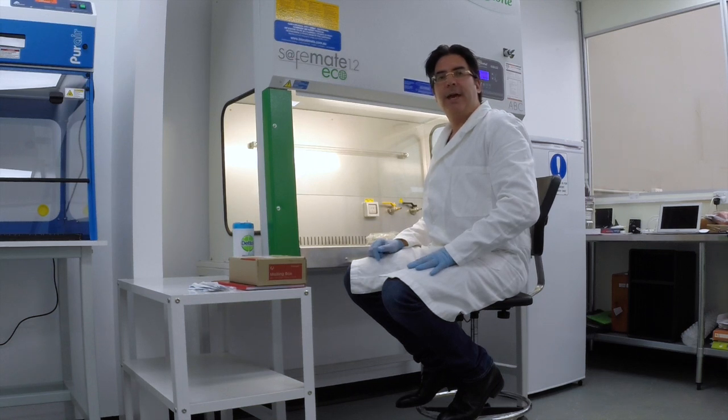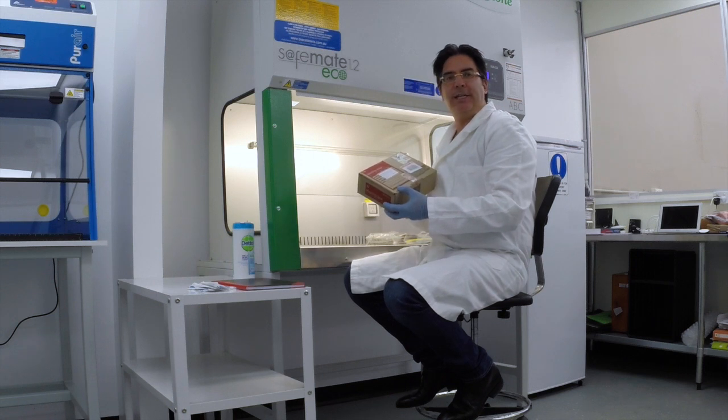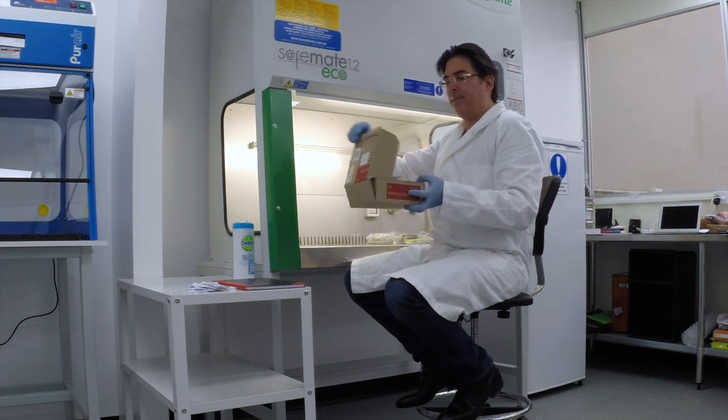Hello, my name is Dr Cameron Jones from Biological Health Services and today I'm going to give you a very quick video overview of exactly what happens when you purchase one of our do-it-yourself mould test kits. Obviously we've sent you the test kit by Express Post and you've done the sampling at your property and we get this back here at our lab.